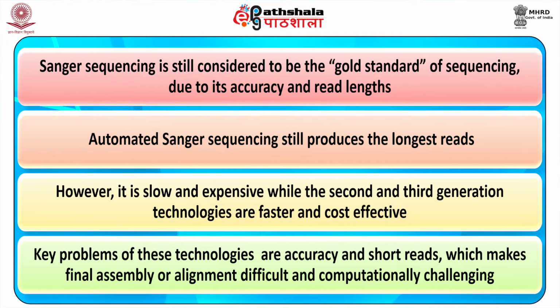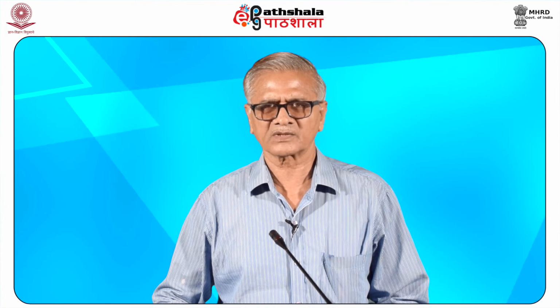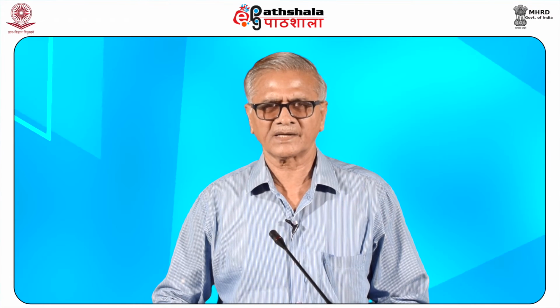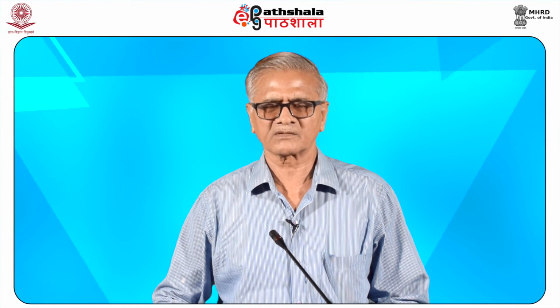The key problems of these technologies are accuracy and short reads, which make final assembly or alignment difficult and computationally challenging. Therefore, the choice of the technology depends on the required application and the advantages and disadvantages of the particular sequencing approach.